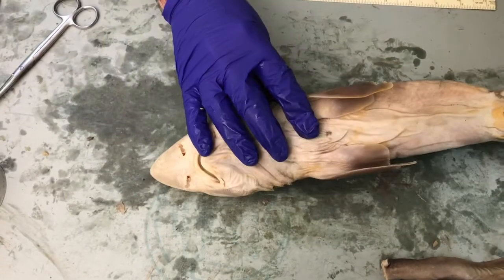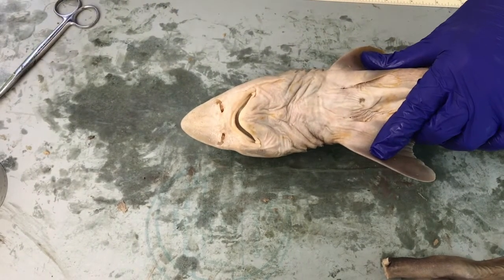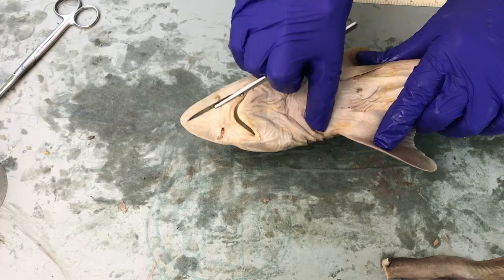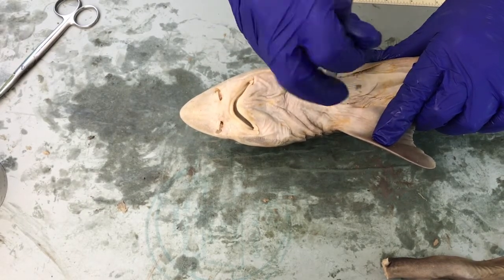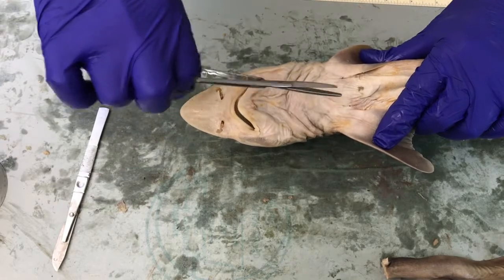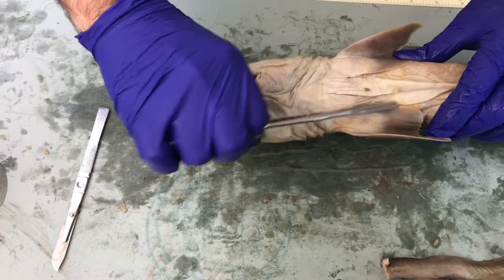All right, let's open this up. I'm actually going to do a couple little things here. I'm going to take the scalpel, which is quite sharp, pointing away from myself. I could see a part of the cartilage that's connecting these fins right there. I'm going to go just under that, and I'm just going to make an incision, and that way I can get a blunt nose pair of scissors in there, and it won't damage the organs that a pointed pair would, right?